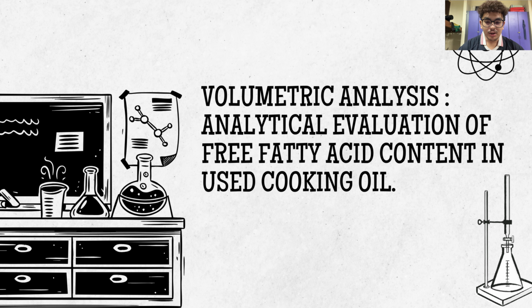Assalamualaikum warahmatullahi wabarakatuh. So today we are proudly presenting for a CHM256 video presentation with the title of Volumetric Analysis, Analytical Evaluation of Free Fatty Acid Content in Used Cooking Oil.